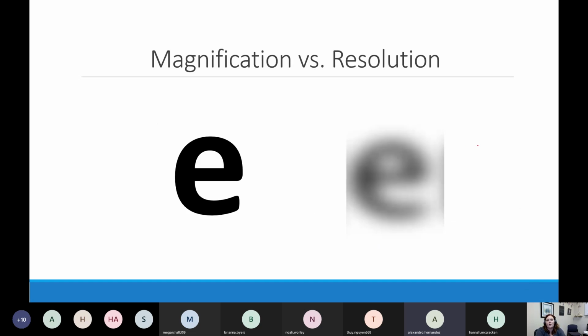When we're using our microscopes, there are 2 things that we can do with the microscopes. The first thing that we are always doing with microscopes, because we just talked about this, is magnification. So magnification, if I were to define that, it just means making something bigger. With our microscopes, the goal is to make things bigger, absolutely. But we don't just want to make them bigger, we also want to make sure that they're clear. So this idea of resolution is basically how clear something is.